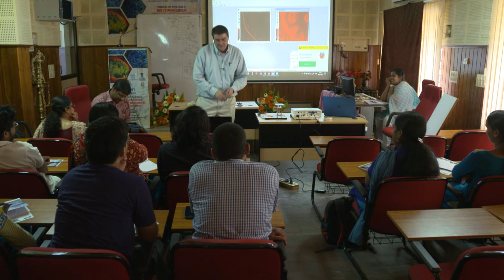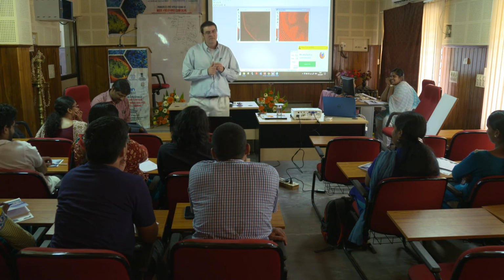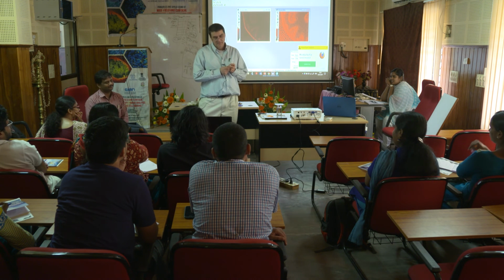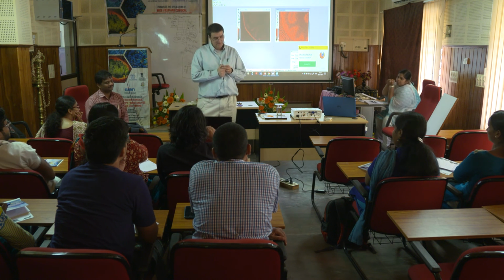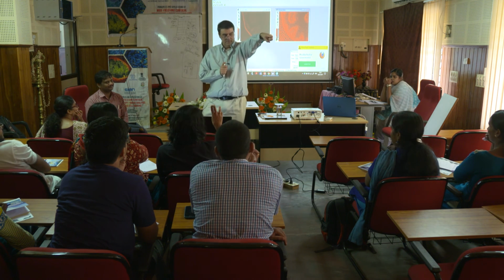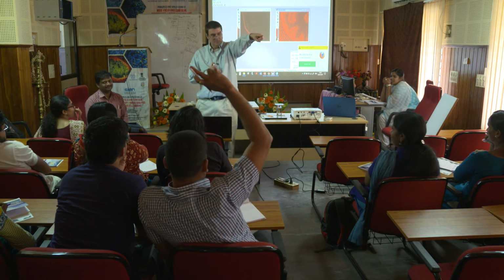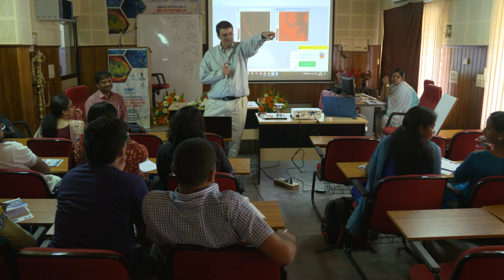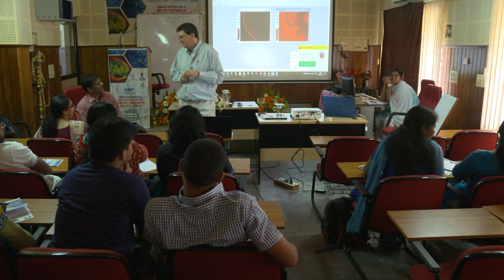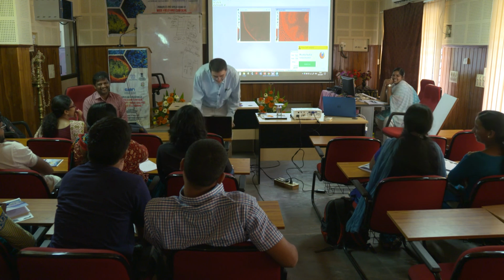Okay. To quantitate in modern biology, you need to use what? Bit depth. For it to be accepted for publication, you have to use what bit depth? What was it? 12. Okay. Everybody answers that one.